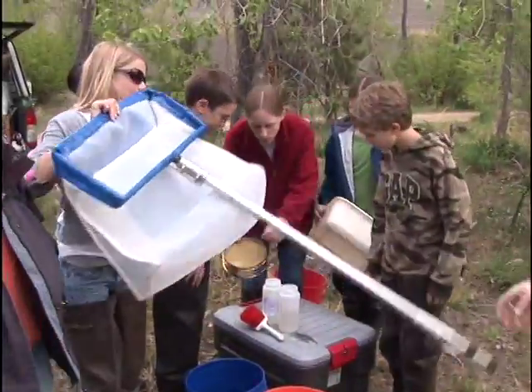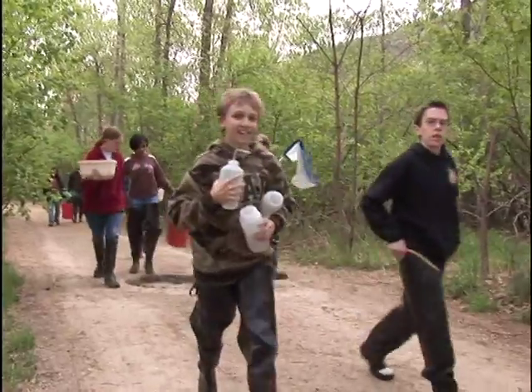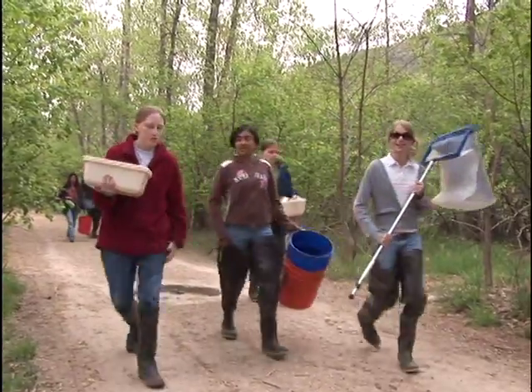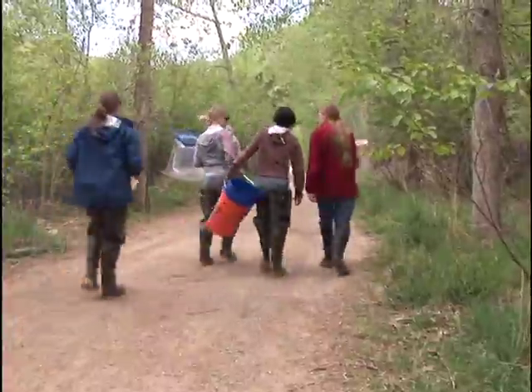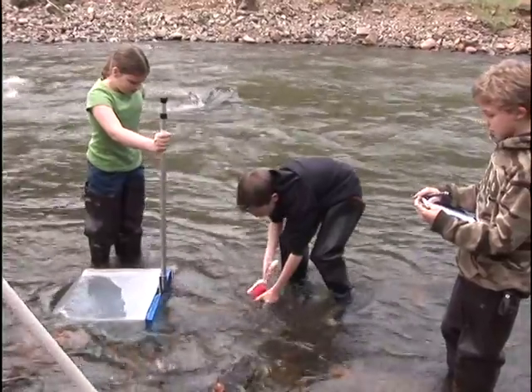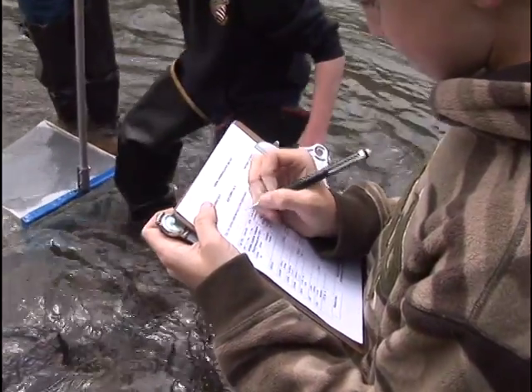When sampling for macroinvertebrates, it's best to use a team approach. When all team members understand their role prior to arriving at the sampling site, your sampling event should run smooth. A macroinvertebrate collection team would likely consist of a timekeeper, kicker, net holder, and data recorder.